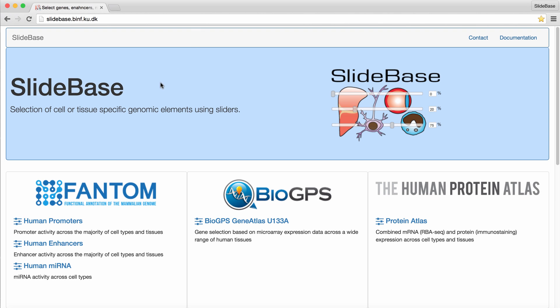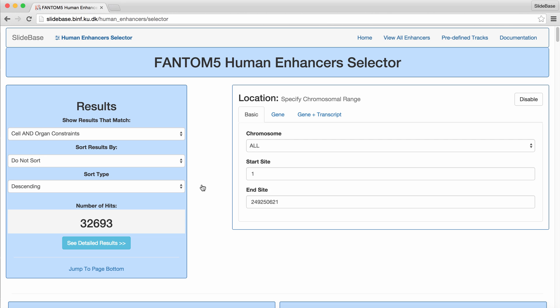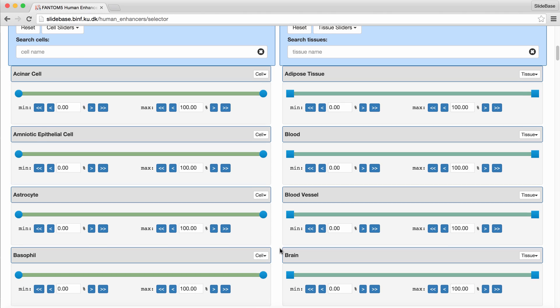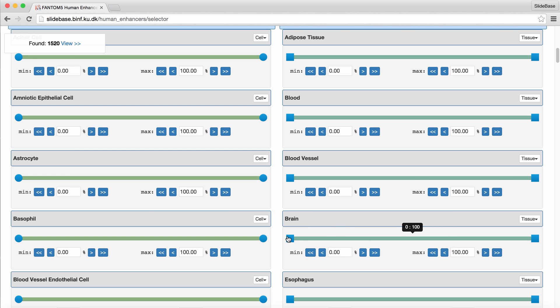I will now show you some user scenarios for enhancer selection in Slidebase. On the Enhancer homepage, we click on the Human Enhancers selector. This is the main enhancer search page. There are over 32,000 enhancers, and this number will change as we define our search constraints. We can define constraints like at least 30% of total expression from this enhancer should come from, for example, brain. We use sliders to define such constraints.